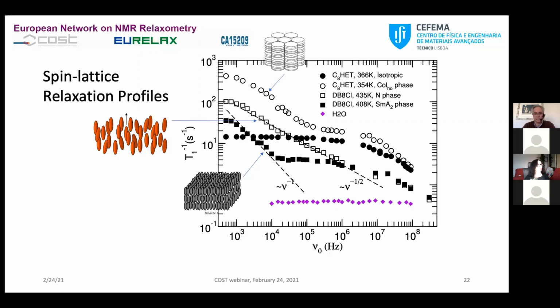Well, thank you very much. But somehow, I do not doubt that your analysis is very profound. However, the message to take is that there are no free lunches, in this sense that NMR is a powerful method, but you must know that. That's the message I'm trying to pass here by putting the water relaxation rate here.